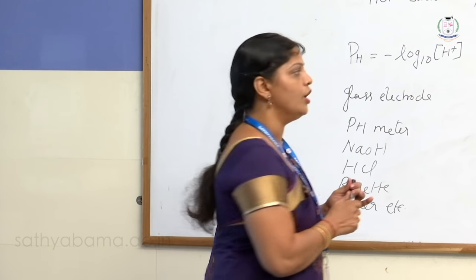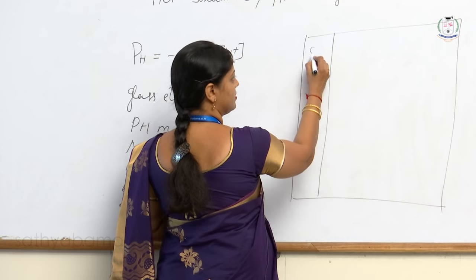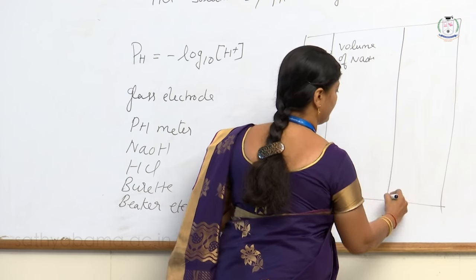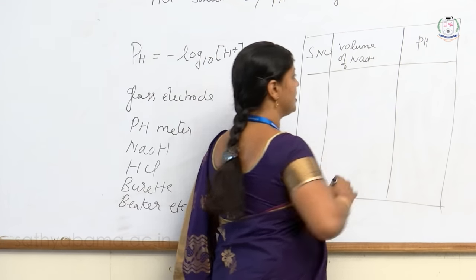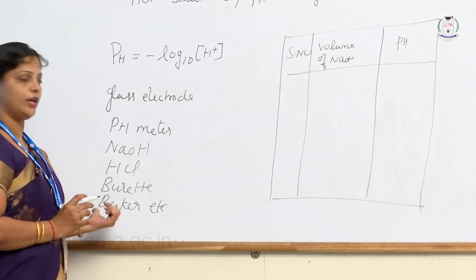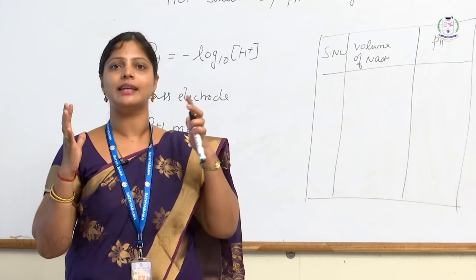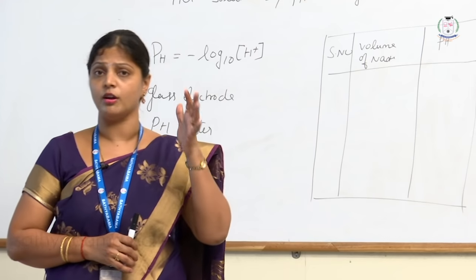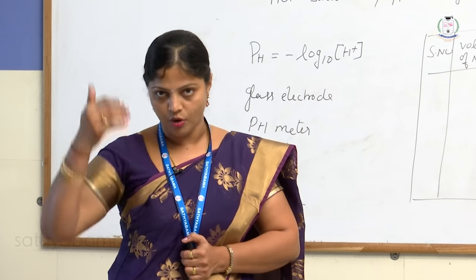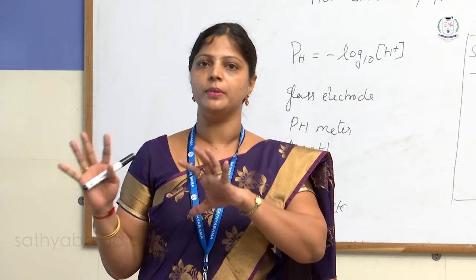Here we do not perform ordinary volumetric titration with titration 1 and titration 2 — there is only one titration. We will measure the pH of the solution by adding sodium hydroxide from the burette to the HCl solution taken in a beaker. We will measure the end point from a graph. We are not calculating the amount, only the strength of H⁺ ions present in the HCl solution using the pH meter. After the demonstration, I will tabulate all values, draw a graph, calculate the end point, and complete the calculations.